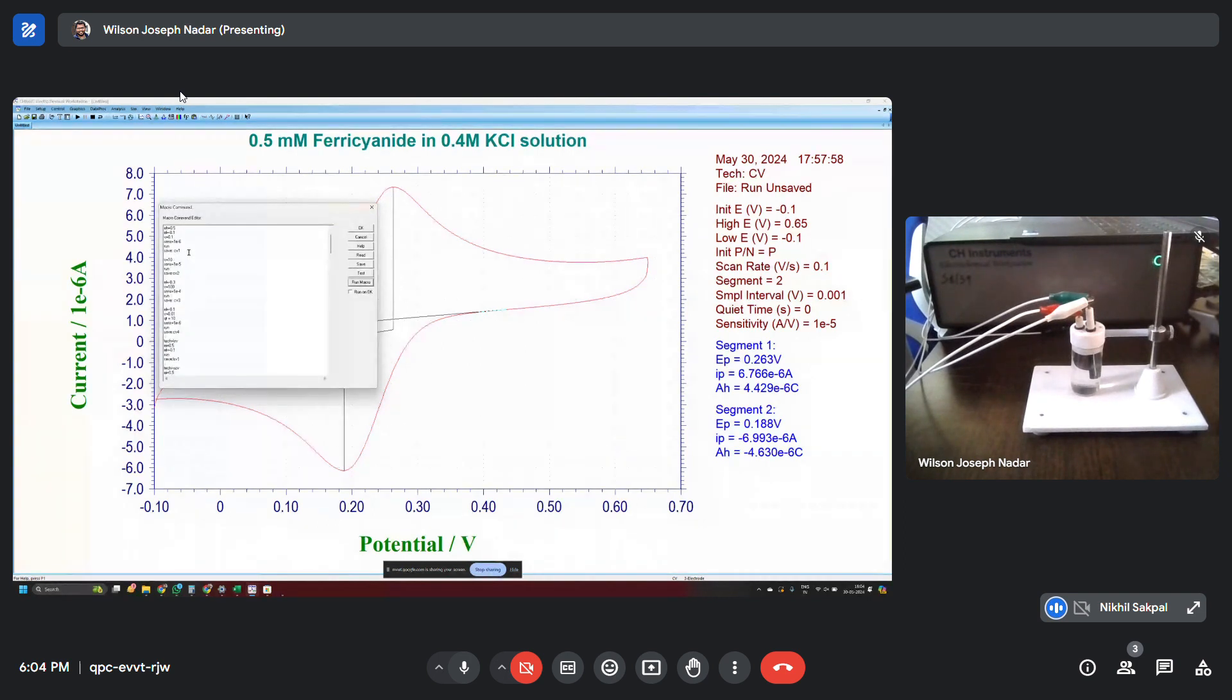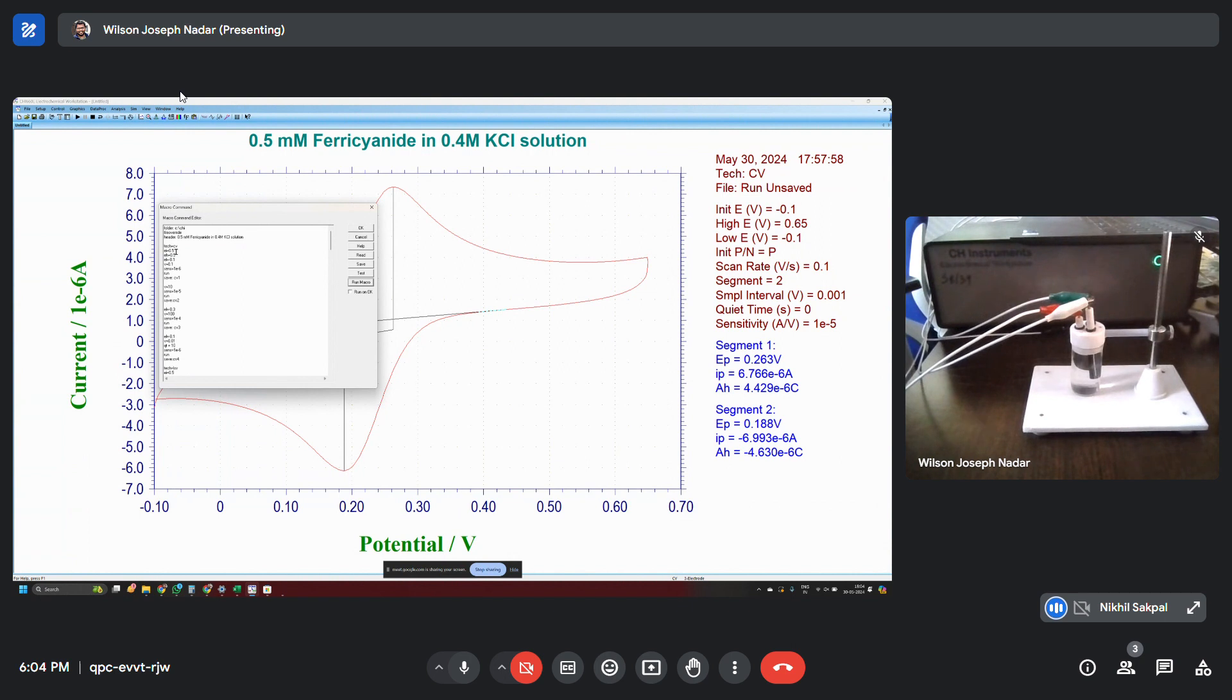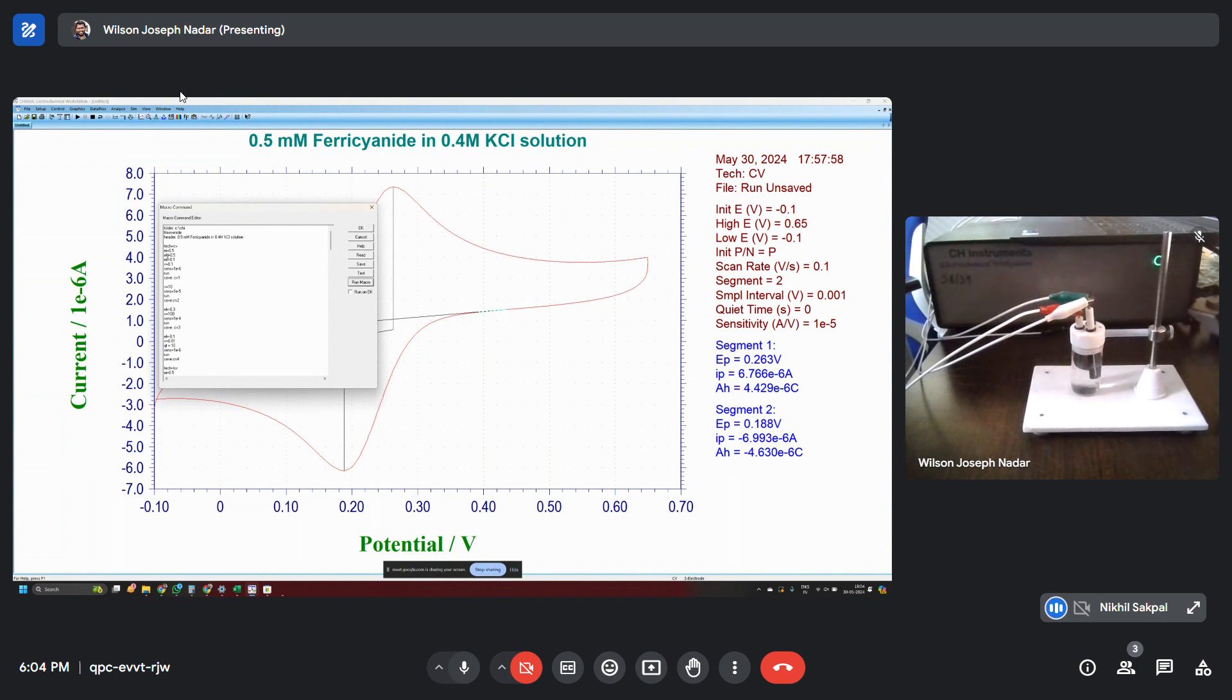And now EI equal to 0.5. That just indicates the initial voltage. E means voltage, I means initial, equal to 0.5 volts. So all of these numbers are in volts. So 0.5 volts. And EH, EH means voltage high equals to 0.5. And then E low, that is equals to, the E low, EL means E low, voltage low equals to minus 0.1.